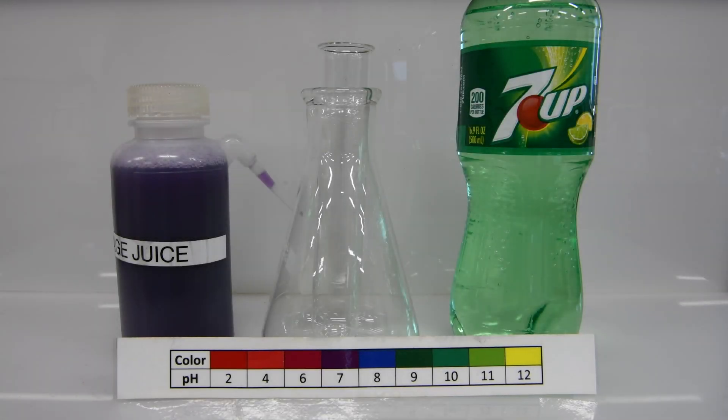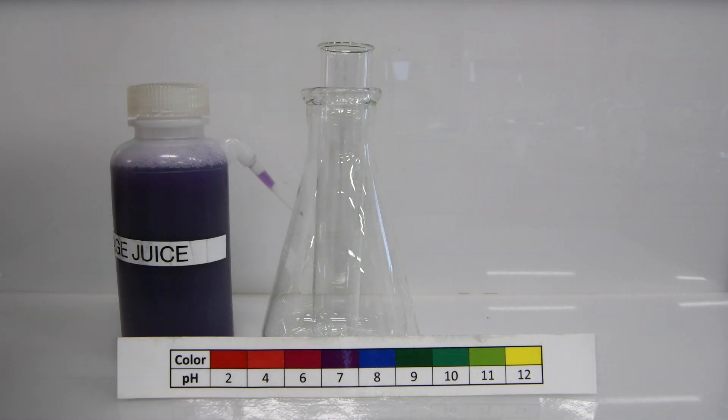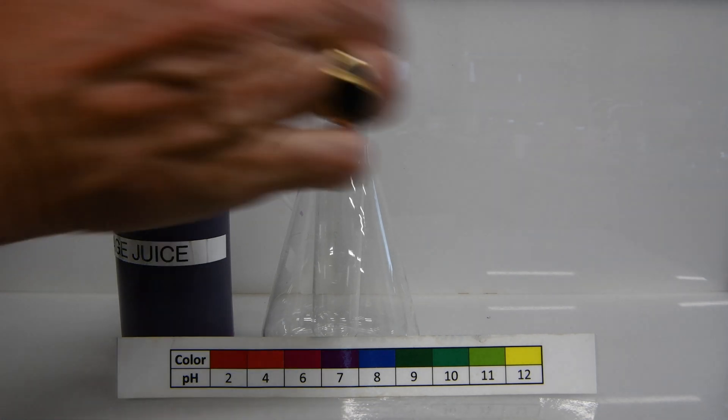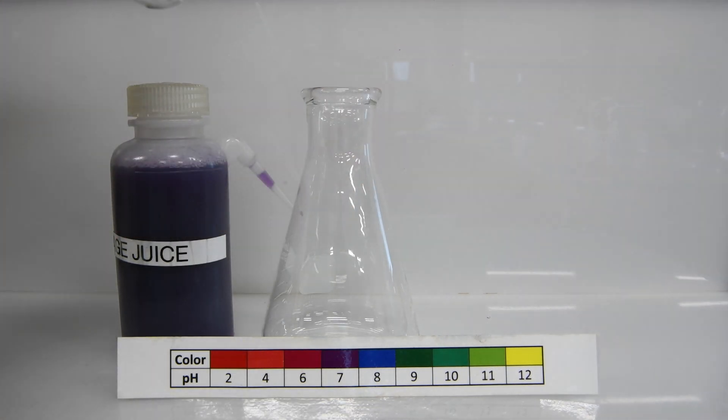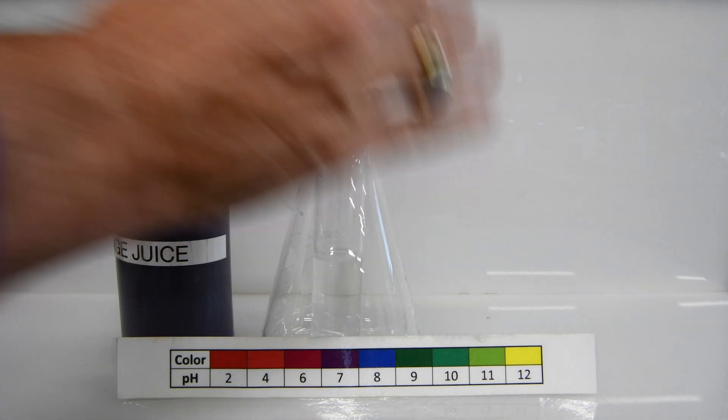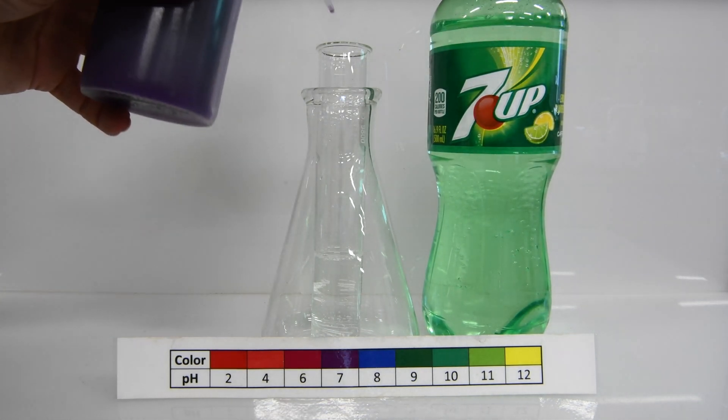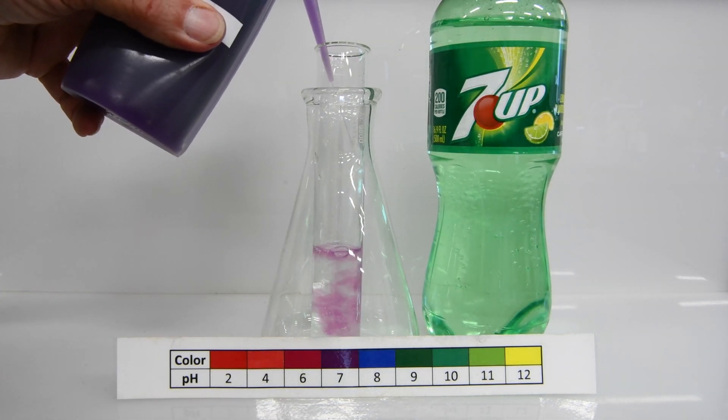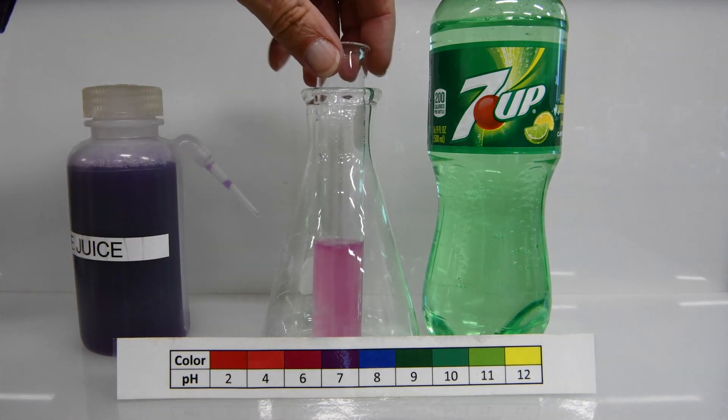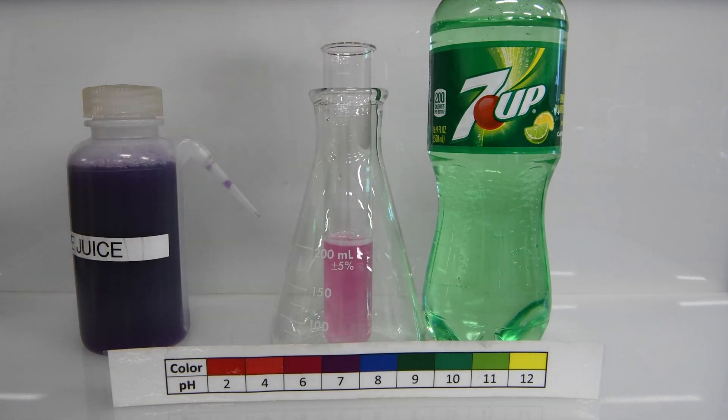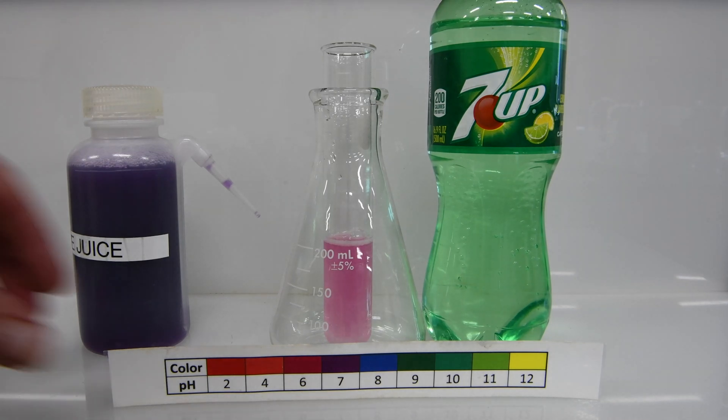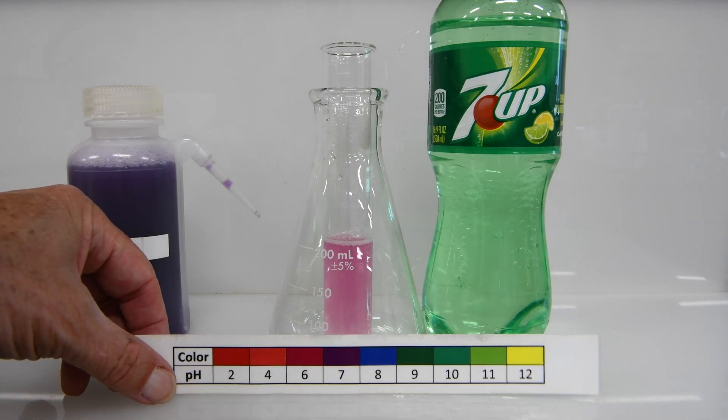The first sample we're going to test will be 7-Up. So let's go ahead and add a sample to the test tube. Now we'll add just enough cabbage juice so we can clearly see the color change. And it looks like it's formed a lovely reddish color. So I'll leave it to you to use the color chart and determine what the pH is.